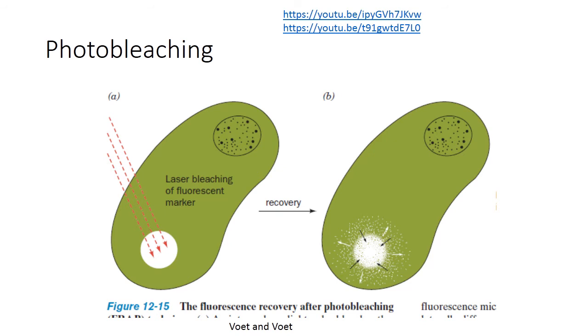In this representation, it shows that the label is present on the membrane. But in many cases, we can carry out labeling of proteins or other molecules which are present in the cytoplasm or in other organelles of the cell. In this way, this method can provide useful information about the mobility and dynamics of different types of molecules in various compartments and locations of the cell.